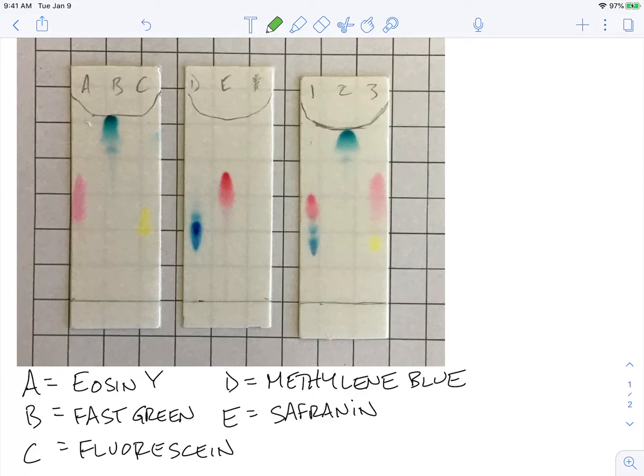So a couple reminders on the bottom of our screen here, we have the identities of the stains that were used in our lab for the known values. In the TLC plate on the right, we've got unknowns number one, two, and three.